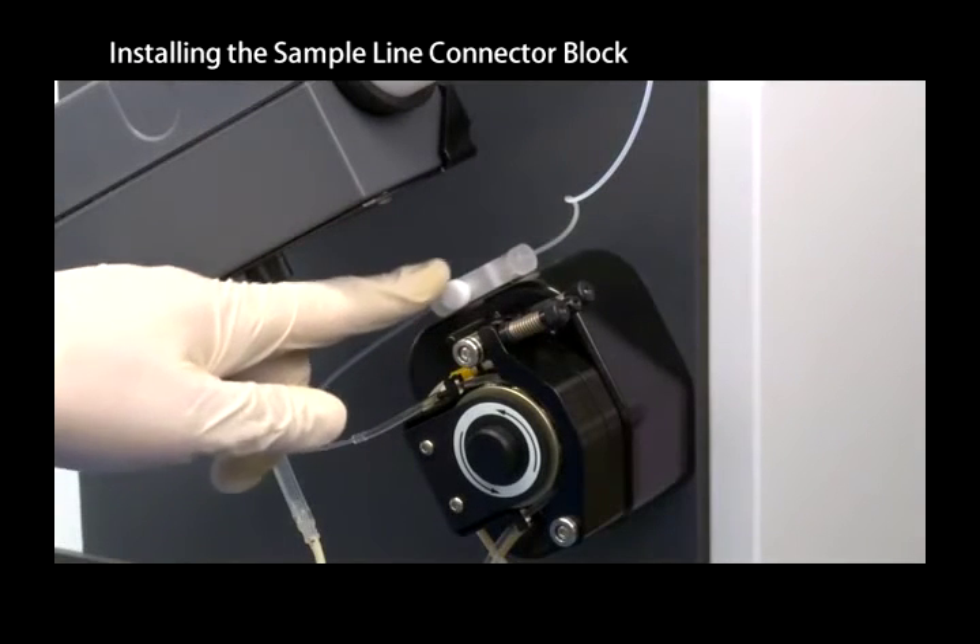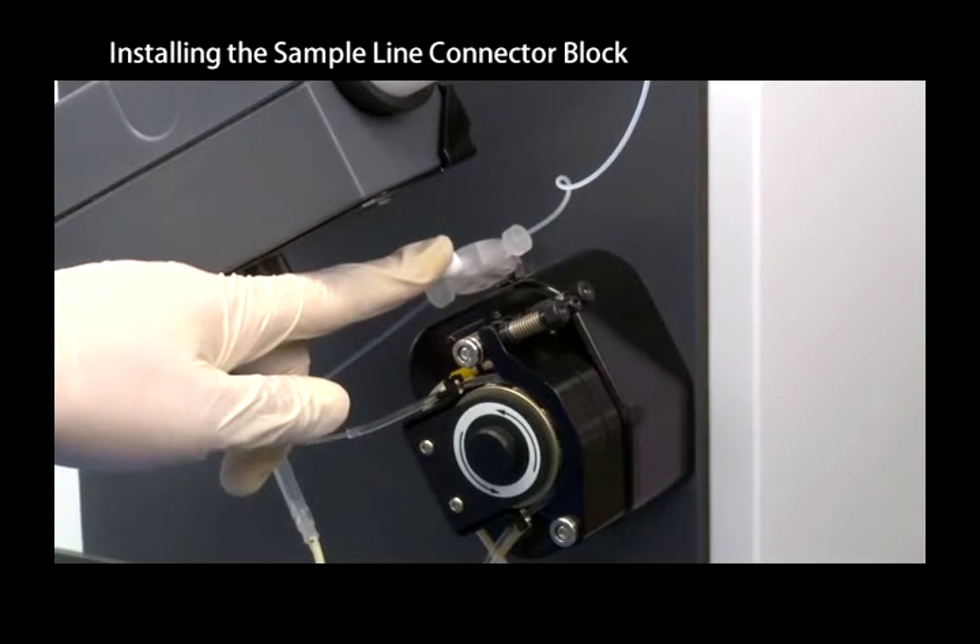Allow the sample to flow for about 1 minute and then check each connection for leaks. If you discover a leak, tighten the PTFE nuts some more.